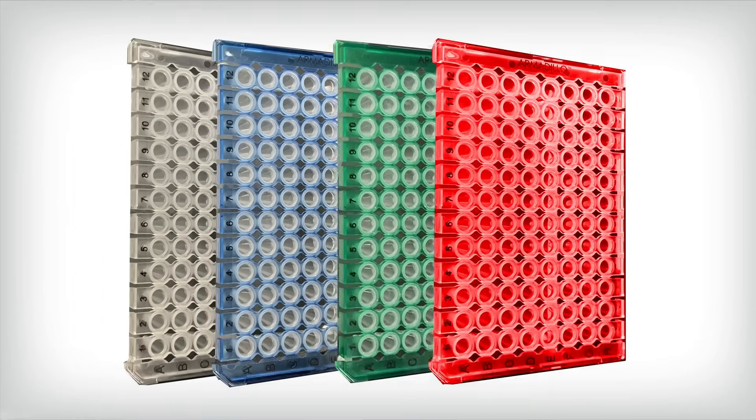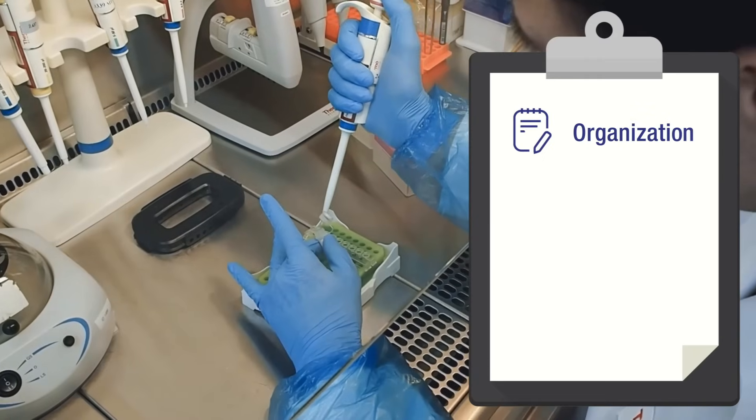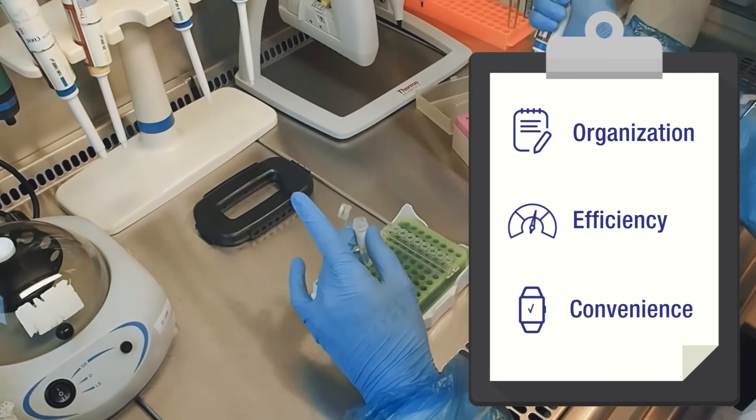Available in several different colors, Armadillo PCR strip plates bring organization, efficiency, and convenience to your lab in a snap.